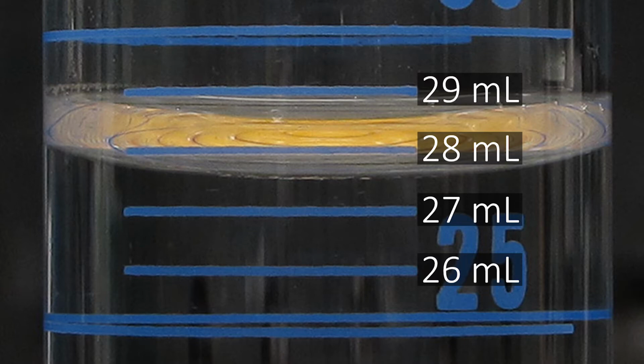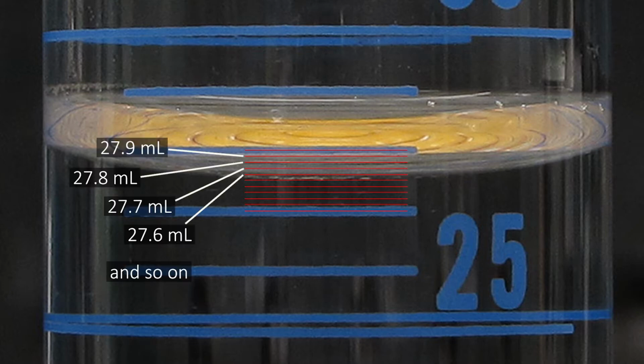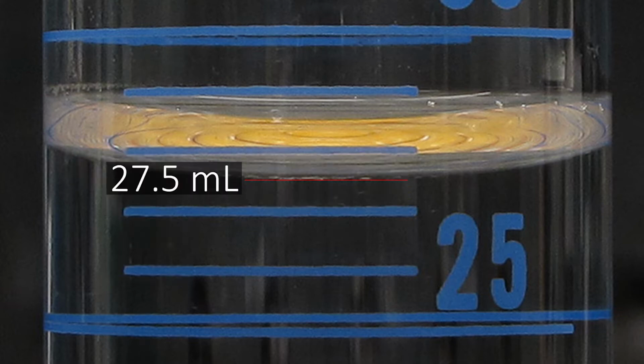To read this properly, we will use our imagination to add an extra set of markings between the real ones that divide the space between the real markings into 10 segments. Since the real markings go up in increments of 1 milliliter, our imaginary ones will go up in increments of 0.1 milliliter. Now we just have to figure out which of these imaginary lines the meniscus's bottom lines up best with. In this case, it seems to line up best with the 27.5 mil marking, so we would read and record this as 27.5 mil.